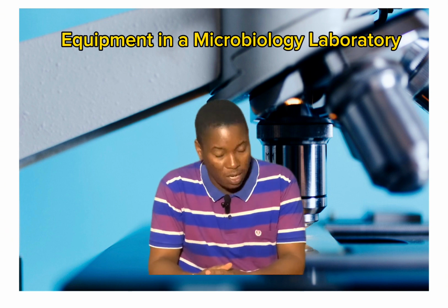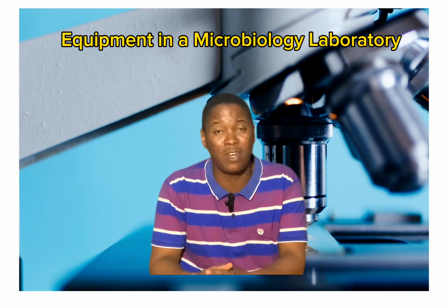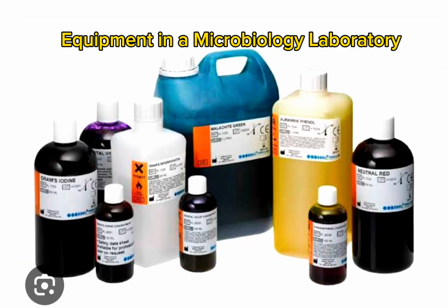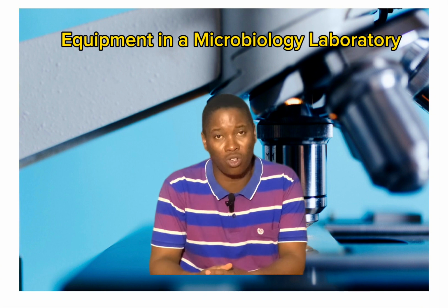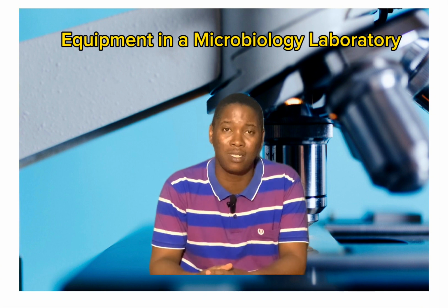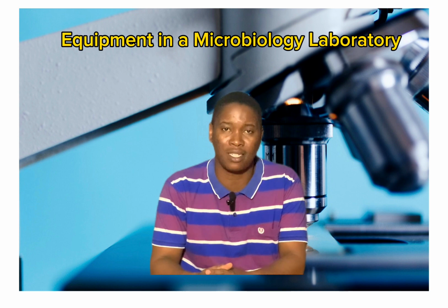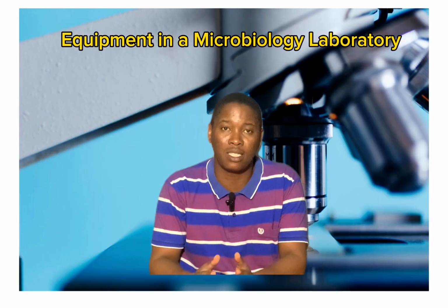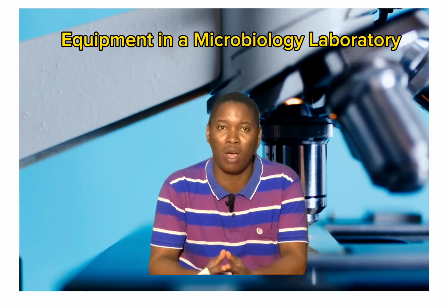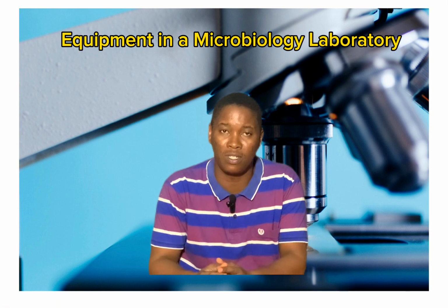These are microscopes. Now, there are also stains and dyes. There are different stains and dyes that are being used in the microbiology laboratory. And what are they used for? The stains and dyes are used to color different microorganisms. The fact is that different structures within the microbial cells absorb these stains differently, thereby creating a contrast within these cells. And when these cells are put up on microscopes, this contrast helps to create beautiful pictures that can be seen and better understood.